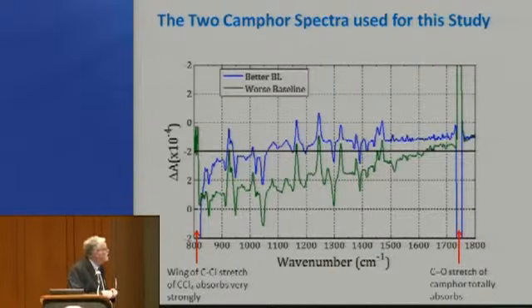The other one is these are carbon tetrachloride solutions, and where carbon tet starts to absorb, you also get a very, very bad baseline. So what looks like a relatively easy problem of baseline correction over most of the spectrum has difficulty on either end. And many baseline correction routines are looking for minima. And that minimum and that minimum are clearly out of whack.